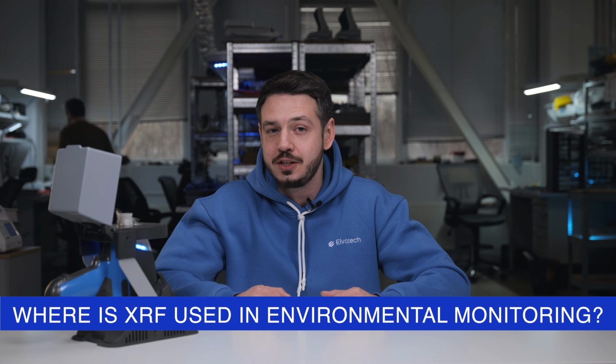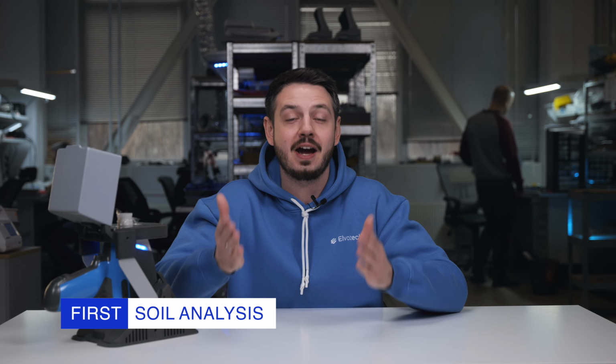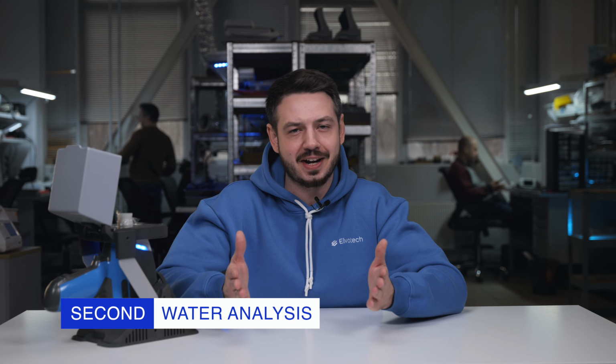XRF is widely used for environmental monitoring in various fields. Let's look at the key areas where this method is indispensable. First, for sure, it's soil analysis. It helps detect toxic elements such as lead, cadmium, and mercury, which can accumulate in agricultural lands and pose a health risk. Second, water analysis. XRF detects heavy metals in water, which is critical for monitoring drinking water, wastewater, and industrial effluents.